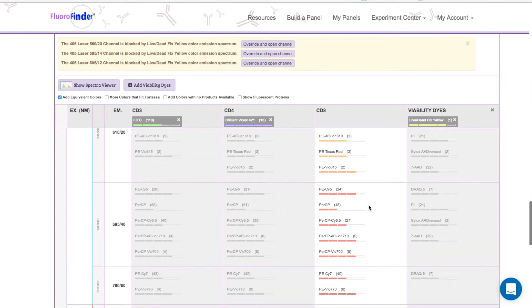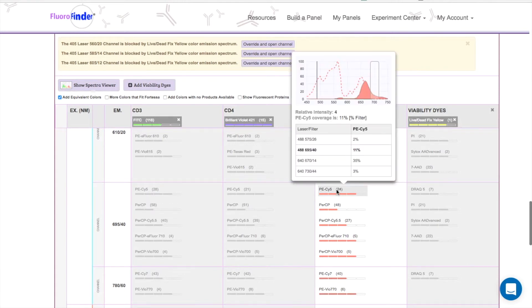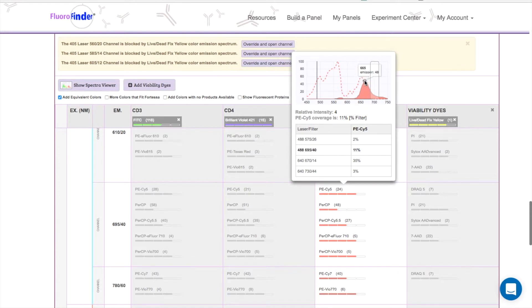As I've been browsing through different colors, you might have noticed that this window pops up whenever I hover over a color. This graph shows the excitation and emission for the color I'm currently on, and also lists a percentage that corresponds to how well this color is being captured by this detector.